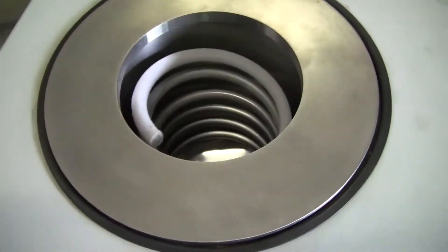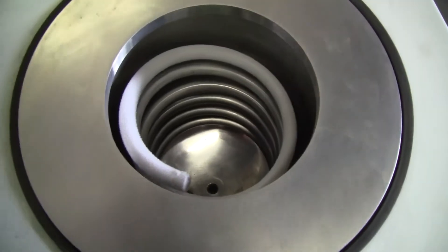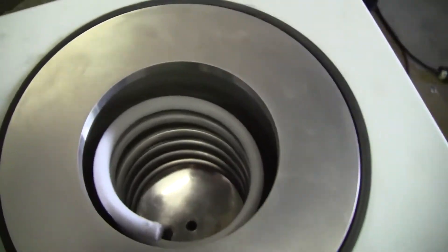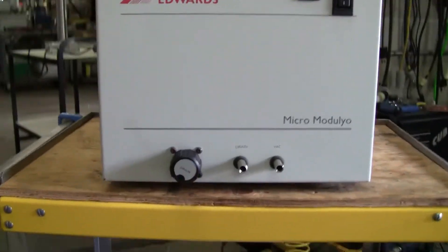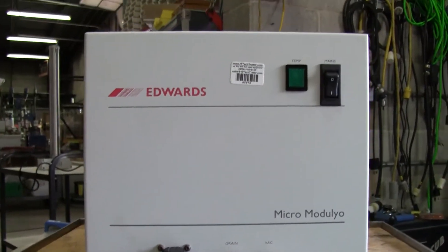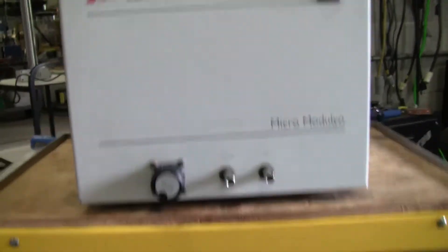Specifications for this unit say that the coil will actually get down to minus 50 degrees centigrade. Nice and clean in there — this really doesn't look like it's been used at all.